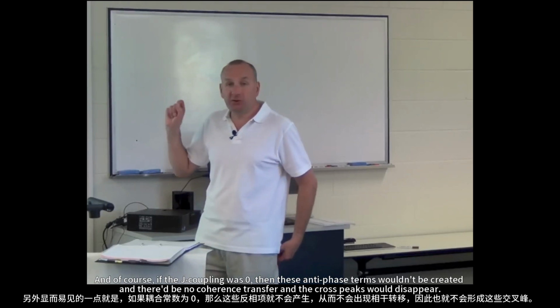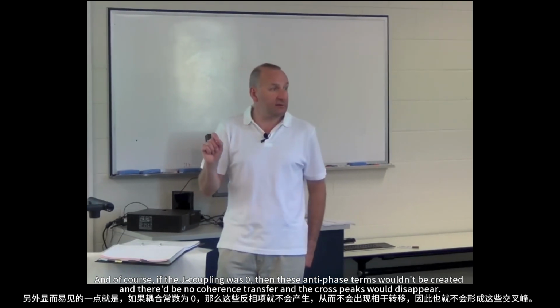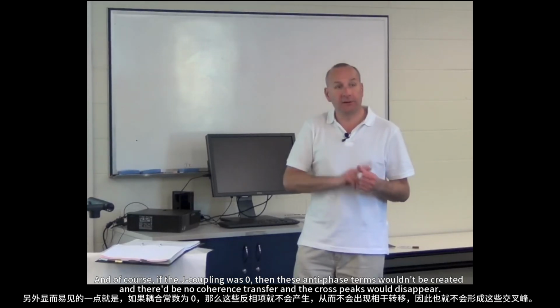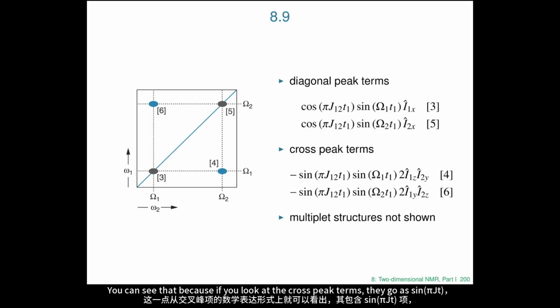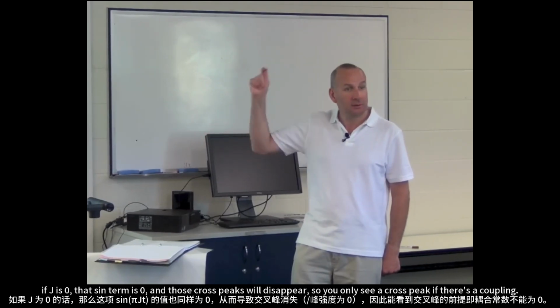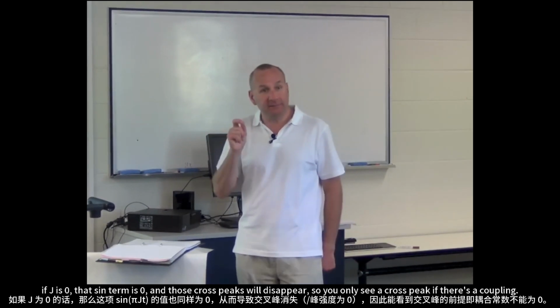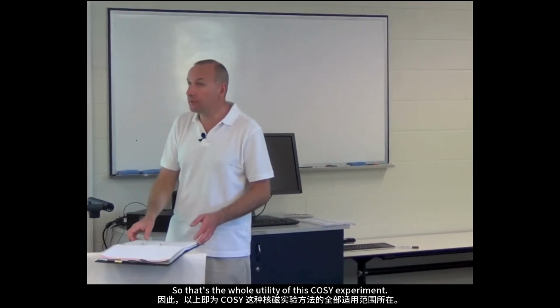And of course, if the J coupling was 0, then these antiphase terms wouldn't be created, and there'd be no coherence transfer, and the cross peaks would disappear. You can see that because if you look at the cross peak terms, they go as sine pi J t. If J is 0, that sine term is 0, and those cross peaks will disappear. So you only see a cross peak if there's a coupling. So that's the whole utility of this COSY experiment.